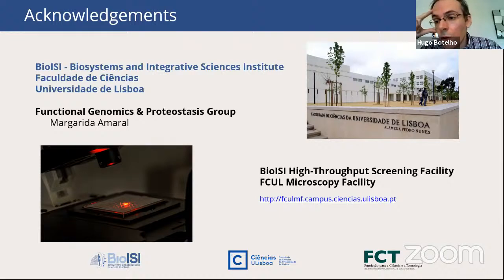So cell painting is used for describing the broader cell phenotype. It involves staining with six different fluorophores, so I don't think it would be easily compatible with also detecting tubulin, because you would be adding an additional dye, a seventh dye. And so it may be hard to incorporate tubulin into the assay itself. That being said, if you have compounds which disturb tubulin or proteins which interact with tubulin in some way, if you perturb cells with these molecules and see the phenotypic changes with cell painting, this would be one way to use the assay to answer part of your question.